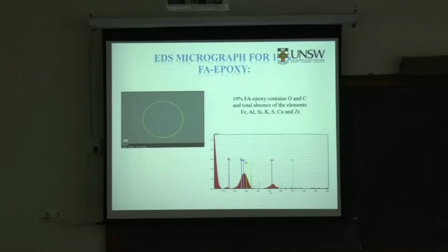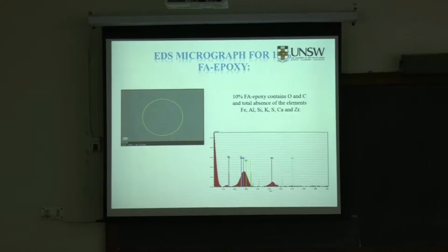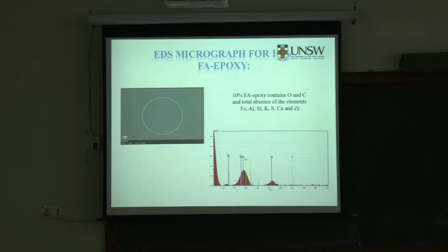Now, EDS micrographs, if you go for 10% fly ash epoxy, there you can see more peaks coming up here.